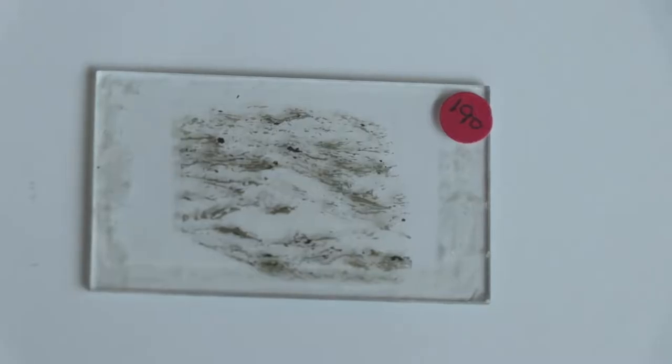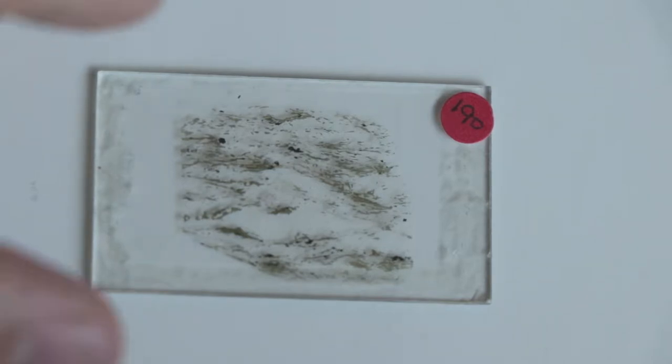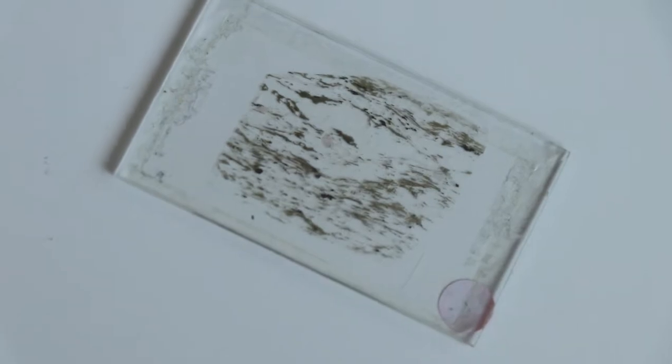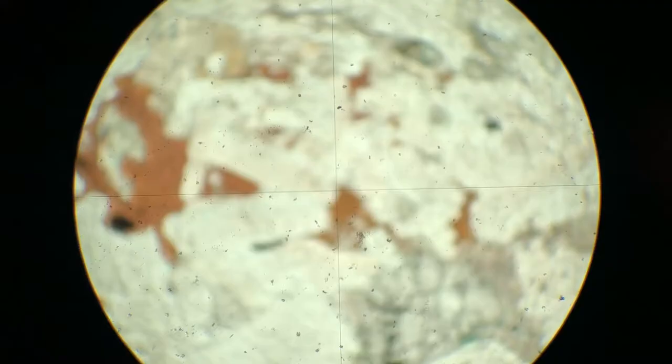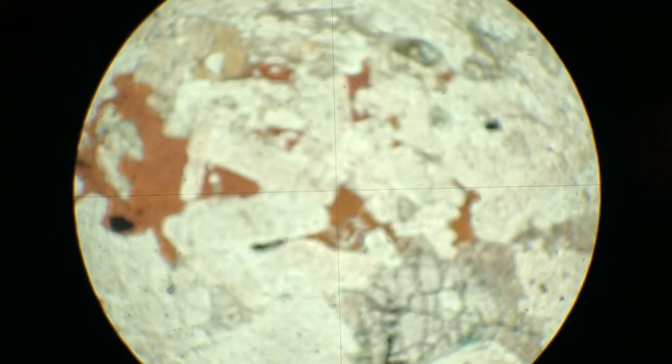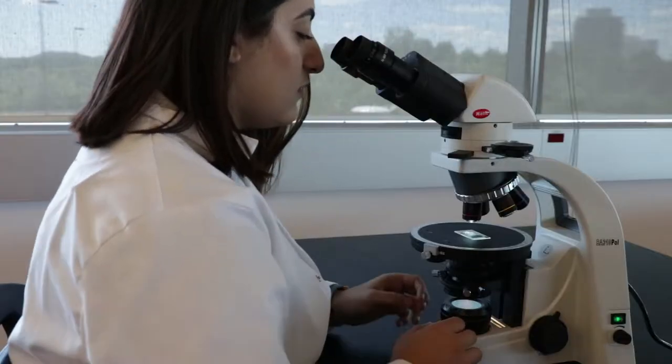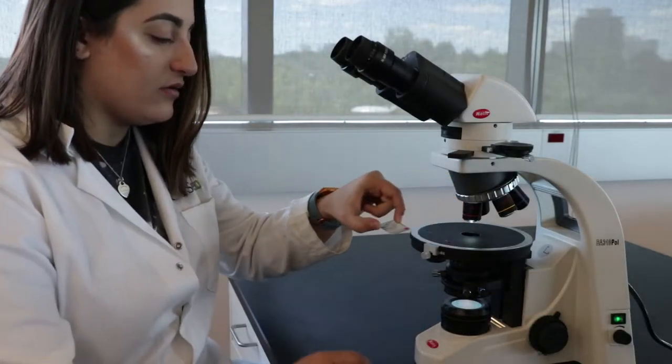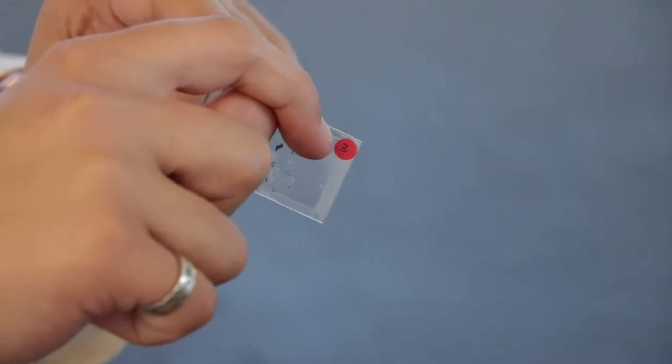Here are some problems you may encounter when doing thin section microscopy. Slides can only be viewed from one side. If the slide is the wrong way up, you won't be able to properly focus. To check which side of the rock thin section is up, find the edge of the cover slip by lightly feeling both sides of the slide.